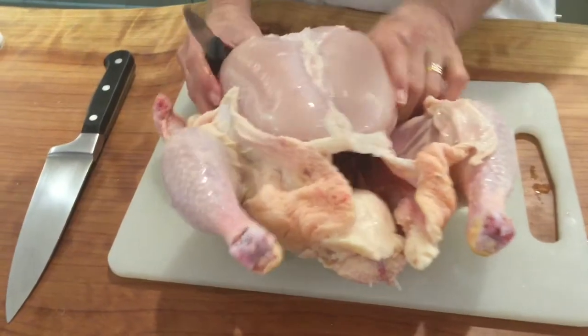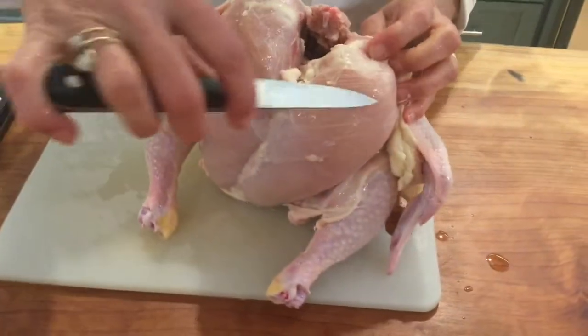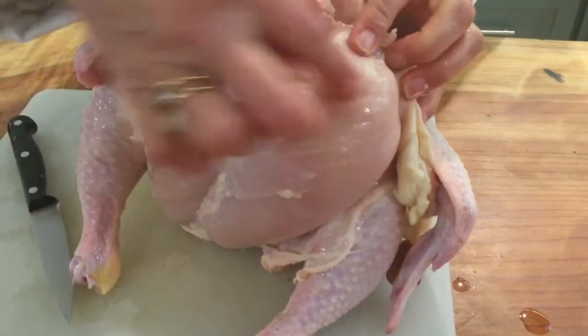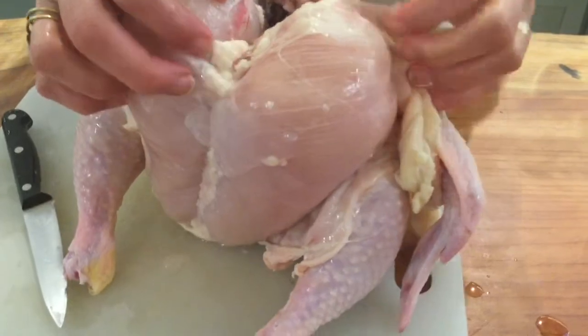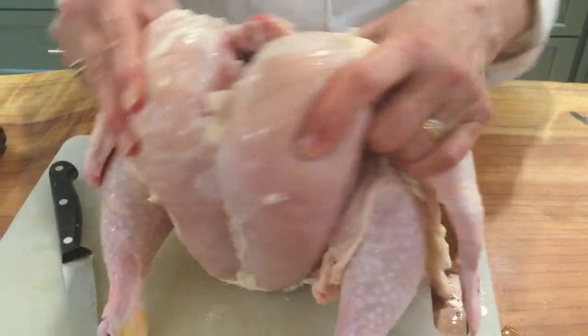The breast muscles on the chicken, you can even see they're made of fibers. Right here you can see the lines on them. Muscle tissue is always long and skinny and fibrous. So this is skeletal muscle. These are muscles that are voluntary, that the chicken can control.